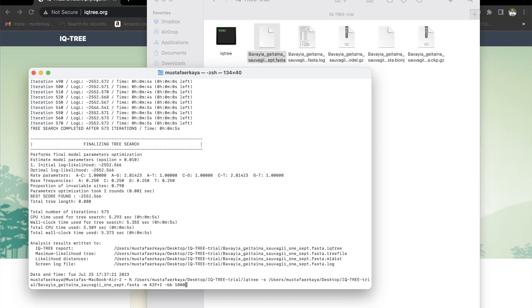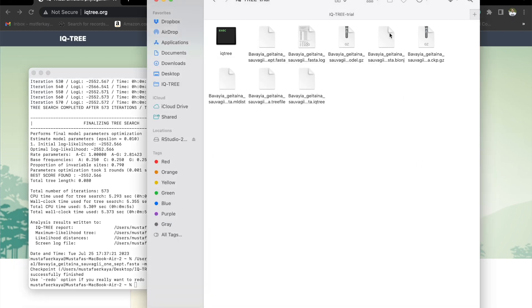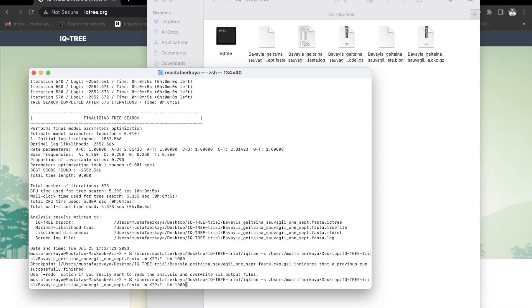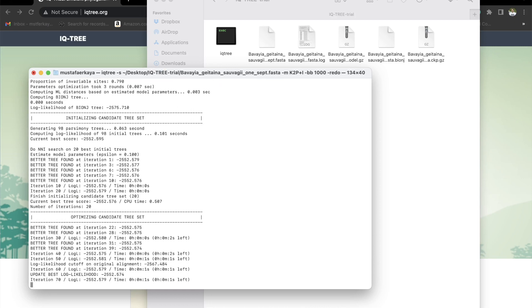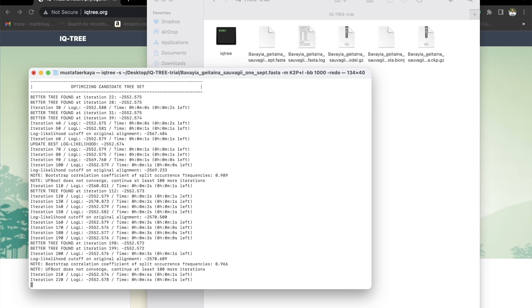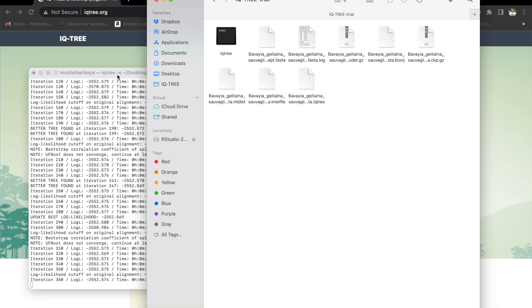Now, when you run this code, it's going to give you an error, because there are already a bunch of files inside this folder. What we need to do is retype this code by adding a --redo flag. This time it's going to overwrite and replace all of the files that are already in this folder.